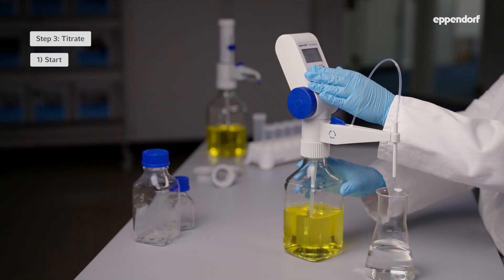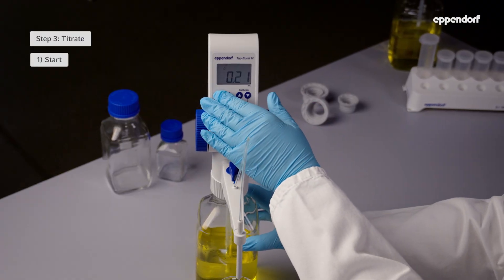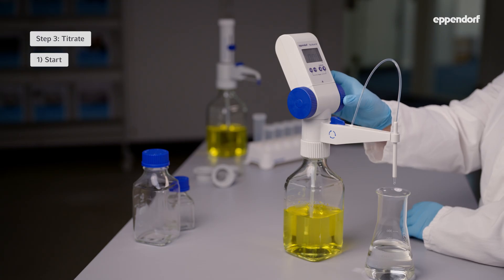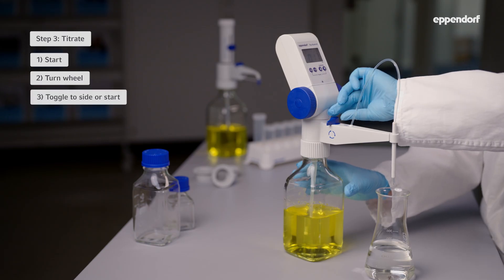Step 3: Titrate. Press Start to turn on the top burette. The display will either show zero or the volume of the last titration, and can be reset to zero by pressing Start again. Dispense the liquid by evenly turning the dispensing wheel forward until you've reached your desired result. After the titration process, turn the discharge valve toggle to the side for venting, or press Start to begin another cycle.